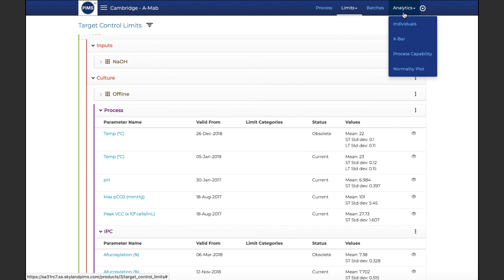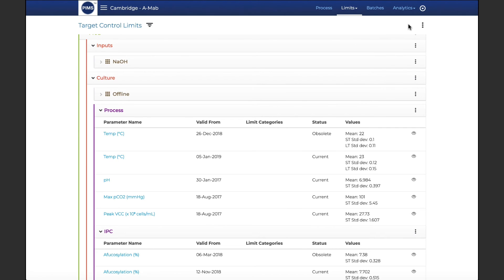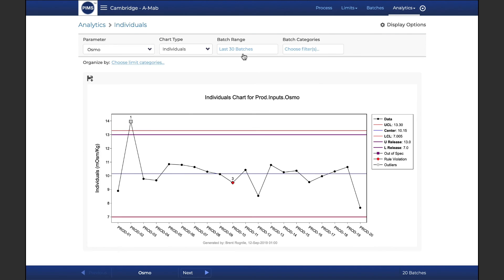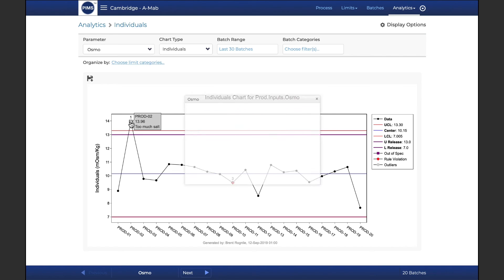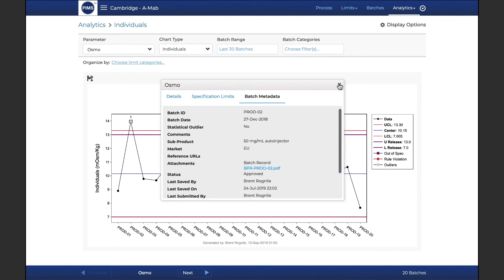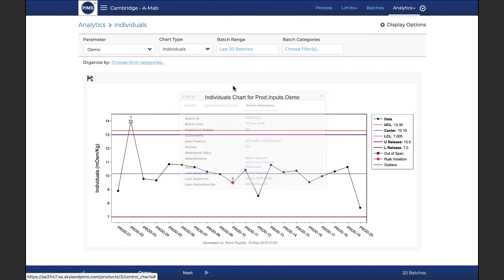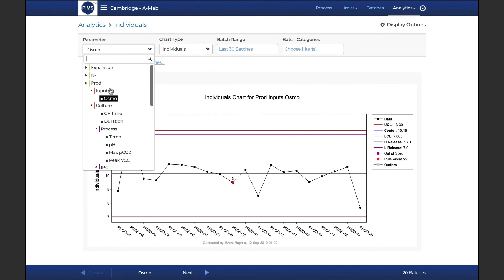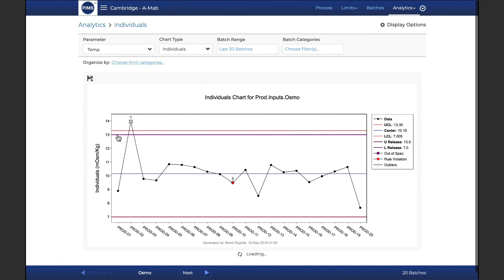PIMS analytics quickly and easily transforms your data into shared, actionable insights. Without the need for coding or querying, PIMS generates charts and reports that improve understanding and control of process and product performance, including segmented process control charts.